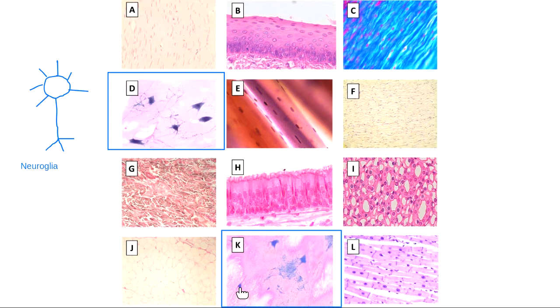So a note for you to make for yourself in general, when we're looking for nervous tissue, always look for a pink background with blue cells. Really large blue cells that are the neurons, and maybe some little blue polka dot cells mixed into the pink stuff as well. So that's the type of tissue that we hadn't looked at yet: nervous tissue. Dark blue cells, and then the little blue polka dots that go with it.